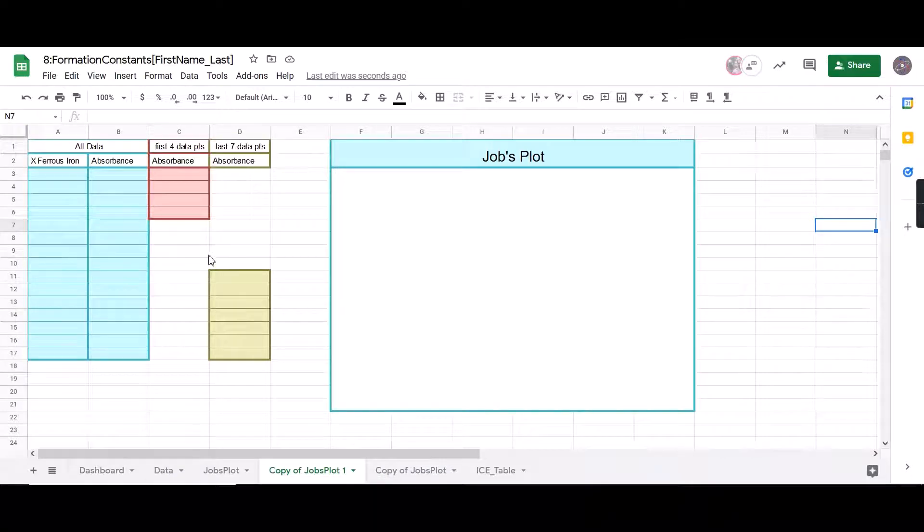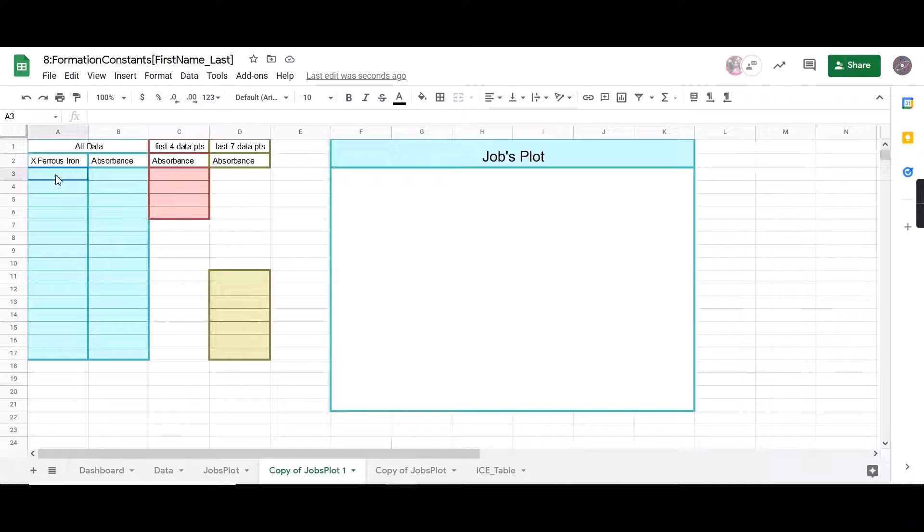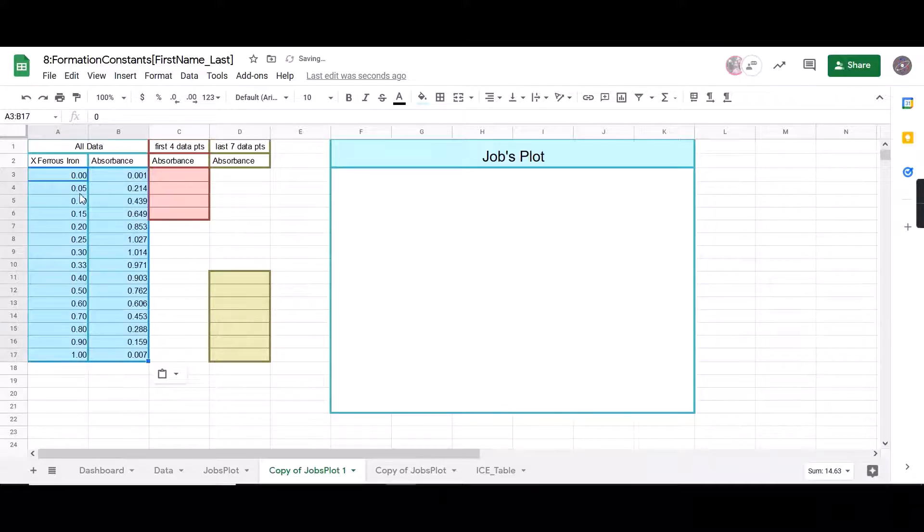Hello everybody, we're going to be going over how to make a Job's plot. First thing I'm going to do is I'm going to paste my data for my mole fraction of iron and my absorbance.